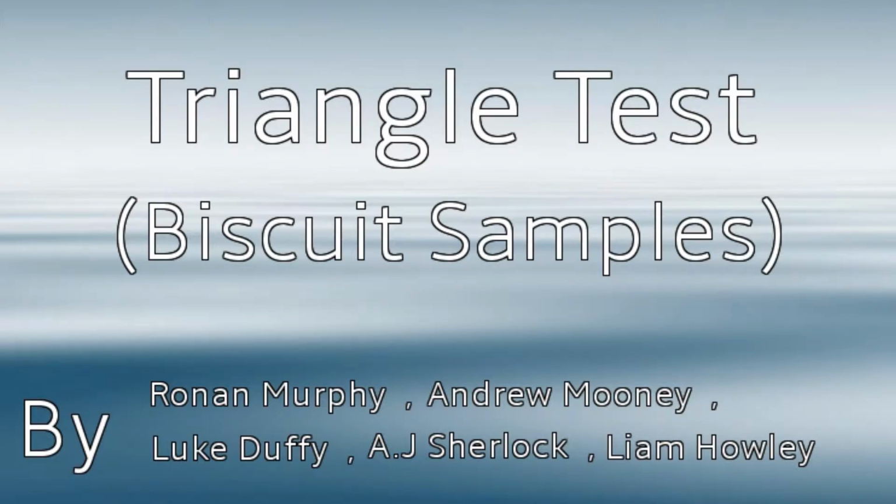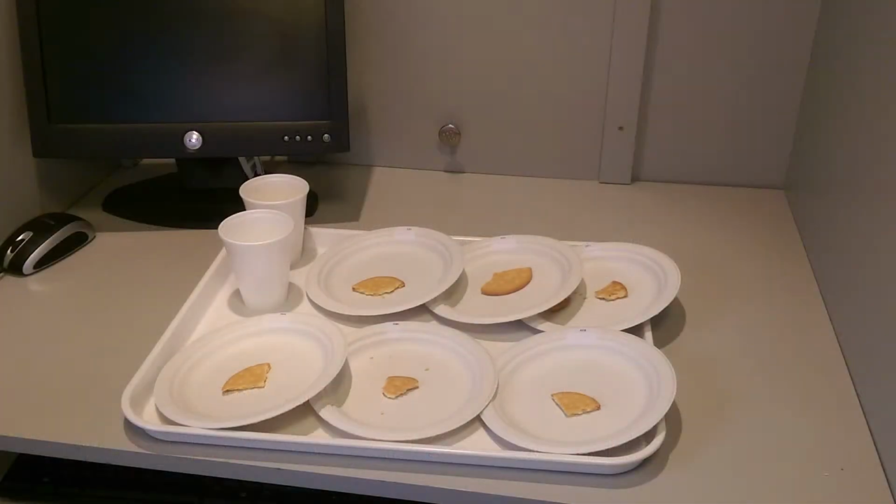Triangle testing on biscuits. In this test, each set contains 3 samples. Of these samples, 2 are the same, i.e., duplicate samples are taken from one of the 2 products. The duplicate sample is usually from the product that is readily available and the one that might be regarded as the more palatable. These criteria generally rule out the product under development, especially at the early stages.